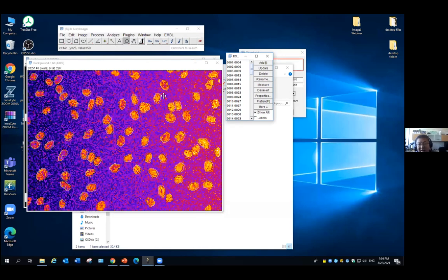I use the algorithm D and apply the mask, apply the thresholding and get the mask image. Then we fill the holes, do the watershed to cut out the connecting objects, and then go to analyze particles. And I will say based on this image, we get a pretty nice outline, the ROI for the cells.